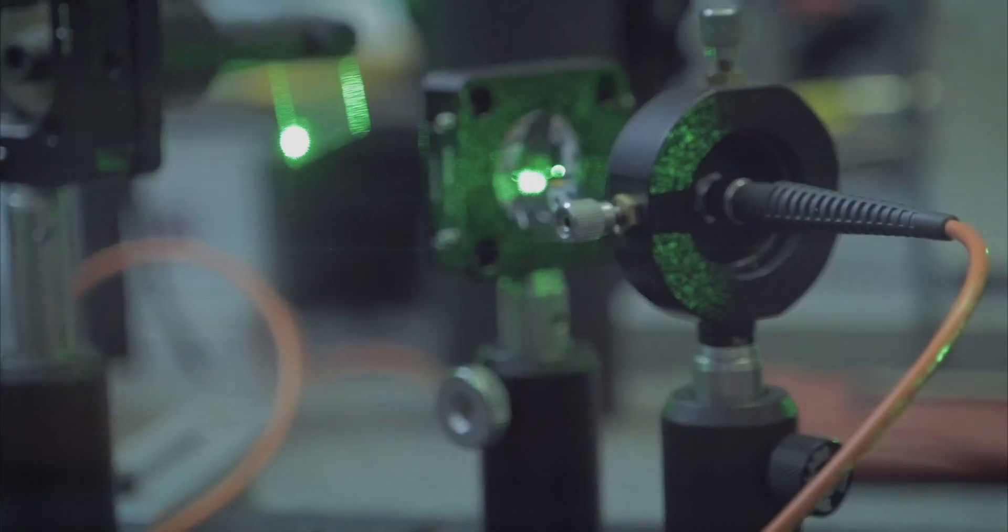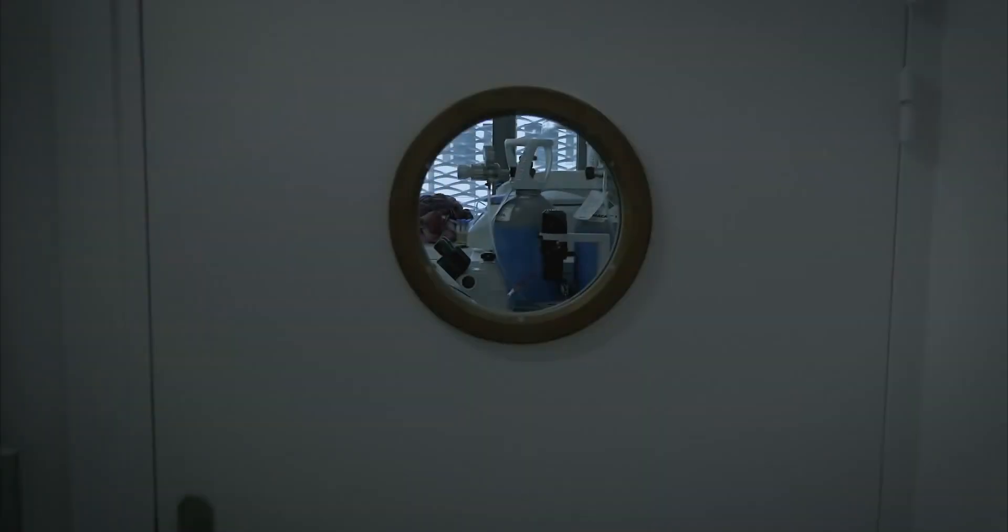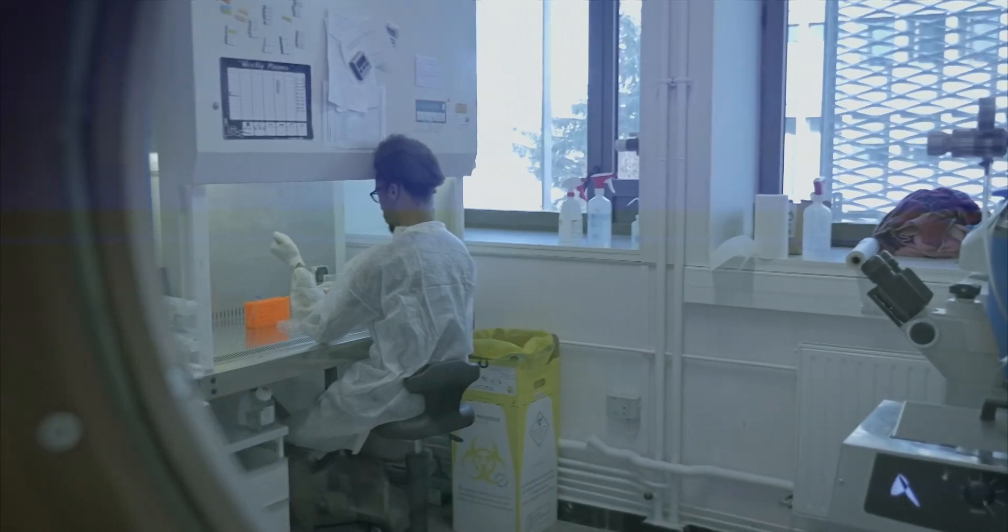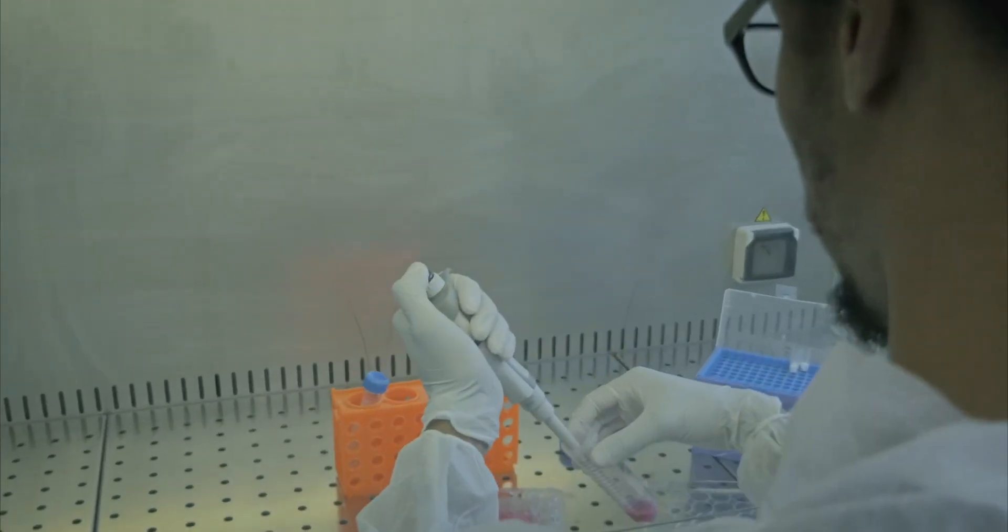The technique, called Brillouin microscopy, is both quantitative and label-free, and biologists and clinicians alike are very excited by its potential for both research and diagnostic applications.